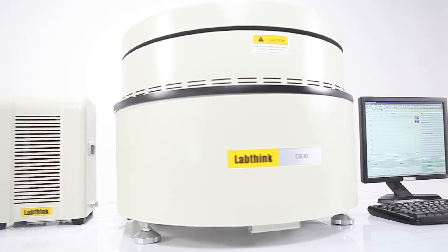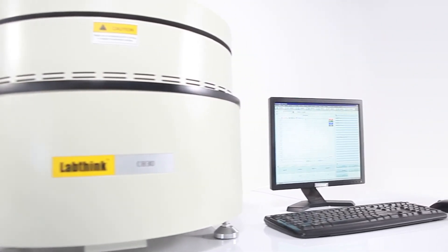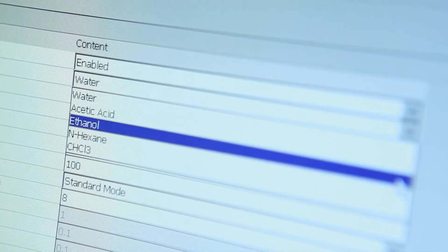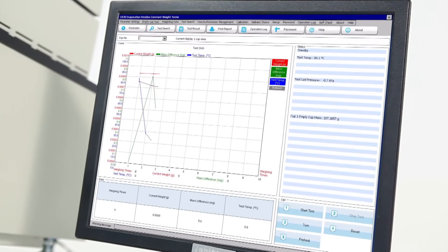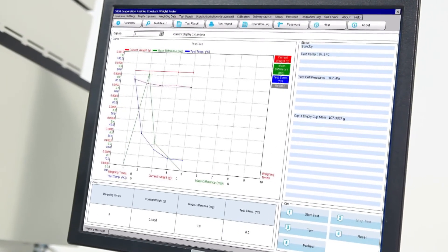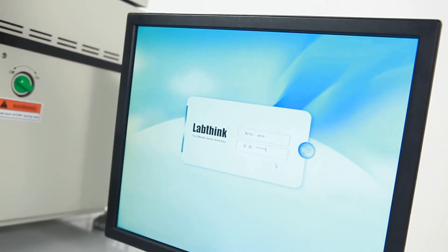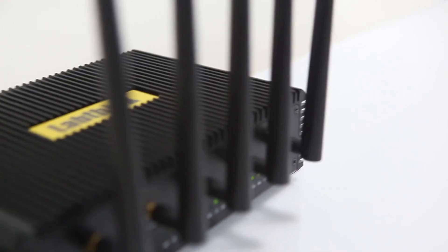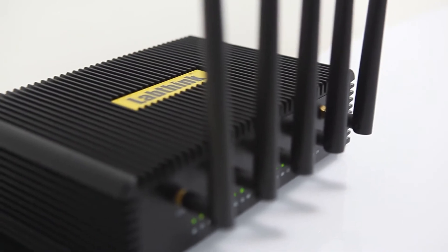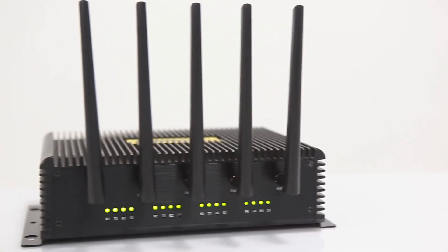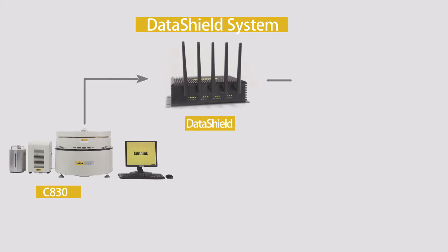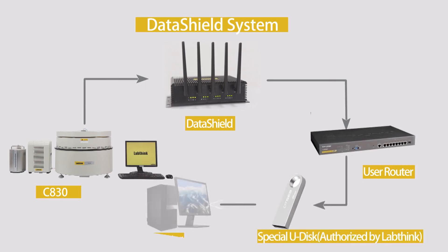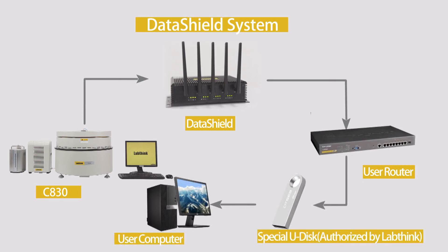C830 is embedded with LabThink's latest operating software, which is featured with user-friendly interface, intelligent data processing, strict user management, and secure data storage. It also supports LabThink's exclusive optional data shield, which provides users with safe and reliable management of test data and test reports.